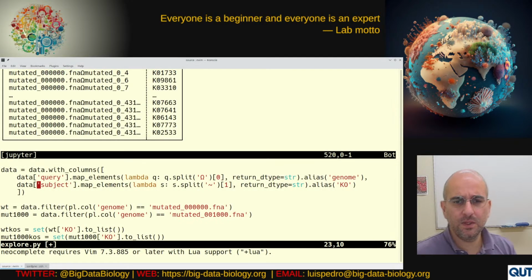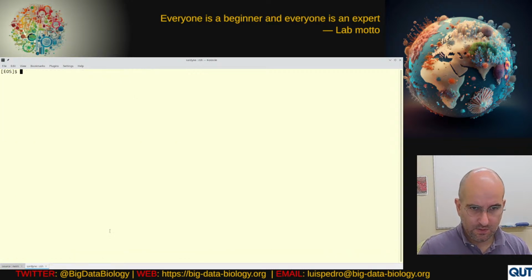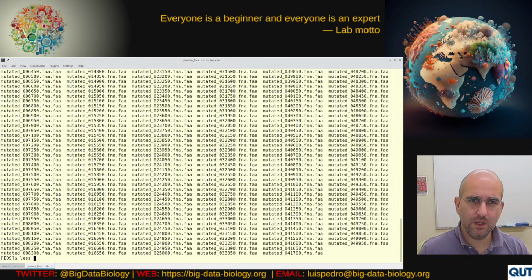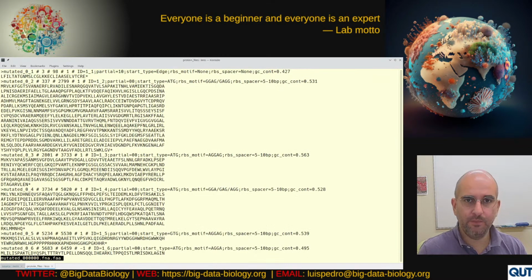So we have the protein files. I said, let's look at 000 FAA. Okay.